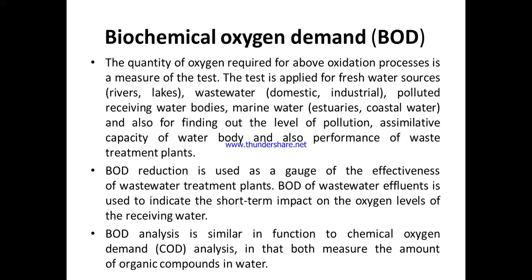for 5 days we set the temperature as 20 degree centigrade. We take the water sample, we determine the initial DO level, dissolved oxygen level, then we store the water sample for 5 days at 20 degrees centigrade in the incubator. Okay, and after 5 days we take out the water sample, we determine the final dissolved oxygen level, and then we can easily calculate the BOD. BOD is given as the initial DO minus final DO. Okay, that difference multiplied by the dilution ratio. What is this dilution ratio?